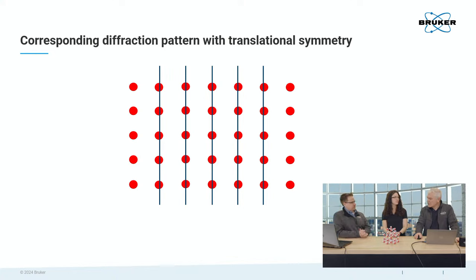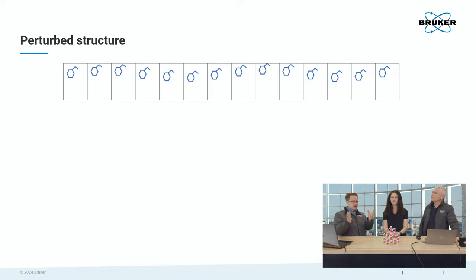But then you use their position to index and determine the unit cell. Yep. So each spot, it's more the positioning of the spots and the arrangement, that's more about the overall symmetry that we see between unit cells. Yep. Okay. So here, this is what Ashley talked about.